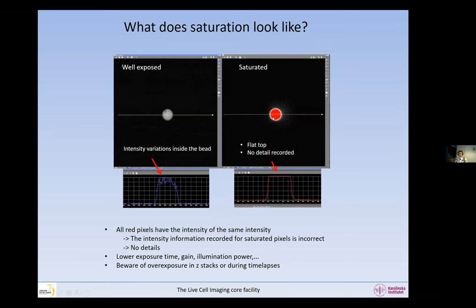When we do a Z-stack, we have to be very careful. Maybe the image we are looking at right now has correct settings with no saturation, but the sample may be brighter above and below. So we may get saturation in Z-stacks. Keep a little allowance when setting your parameters — be aware during Z-stacks or time lapses where you may get saturation elsewhere. You do not want any saturation at all.